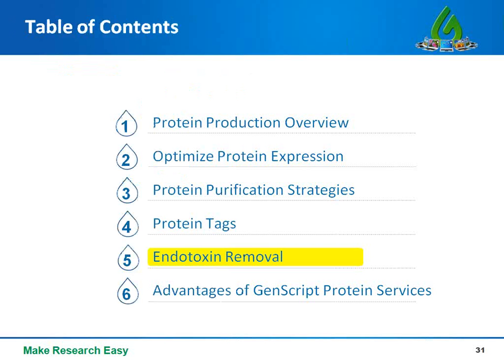Certain applications, such as in vivo studies and therapeutic proteins, require proteins with endotoxin level well controlled under a certain limit. In this section, we will go through endotoxin removal together.